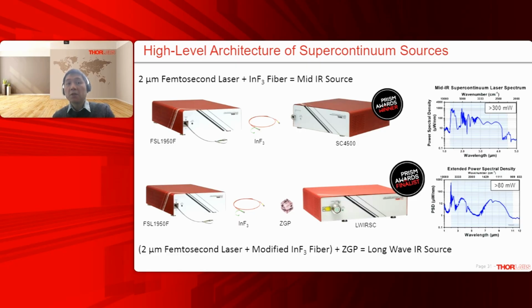The supercontinuum lasers are fairly complex systems. I won't get into too much technical detail on how they work. If we just look at the high-level architecture, both systems start with a 2-micron femtosecond pump laser. In the SC4500, the pump is coupled into indium fluoride fiber to generate the mid-infrared light based on Kerr nonlinearity.